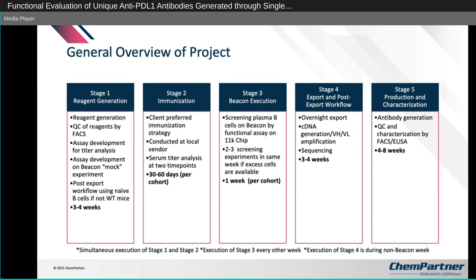Stage 2 is immunization, and as I mentioned before, we do outsource this process at a local vendor. We perform a serum titer analysis, and typically this process can be for 30 to 60 days.